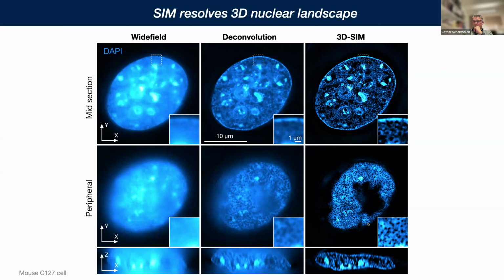In this way, we also get fantastic optical sectioning and separation of features along the Z-axis.